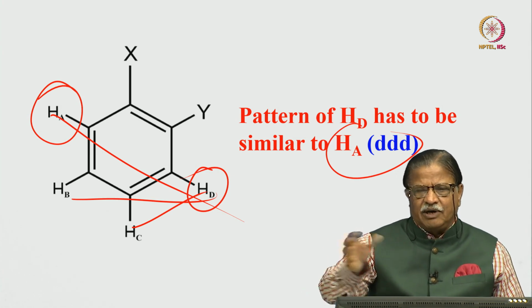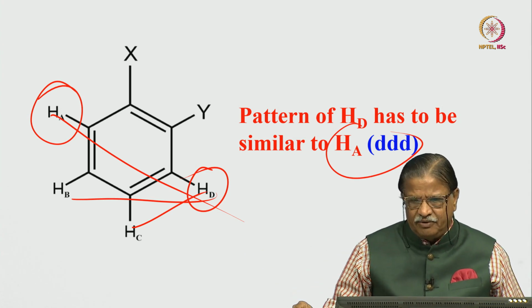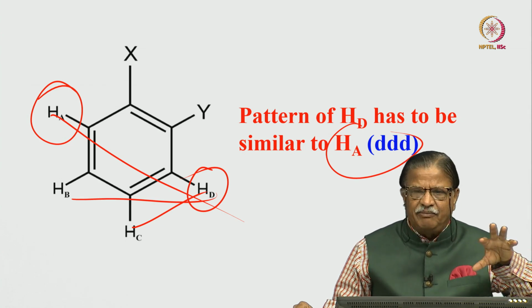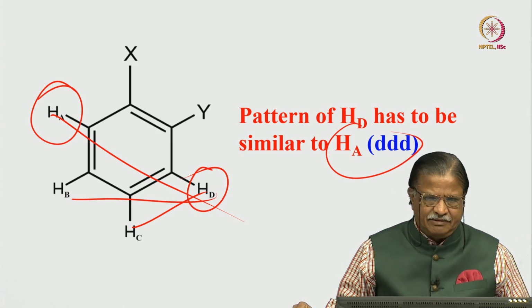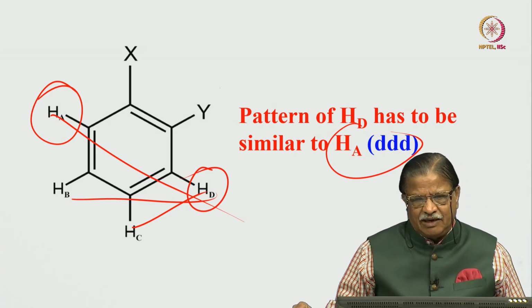One molecule can have protons coupled with two protons, three protons, or groups of protons, and the multiplicity pattern becomes very complex. Looking at the complexity of the multiplicity pattern, we could make rough assignments of all the peaks. By and large, they are correct. But how do you authentically say that? We have to go to higher advanced NMR techniques.